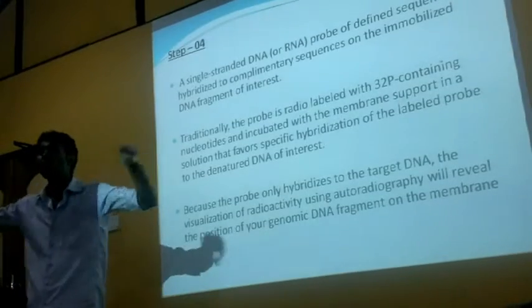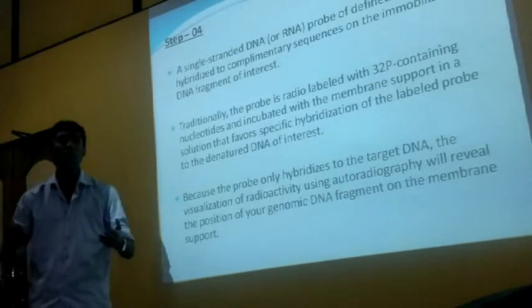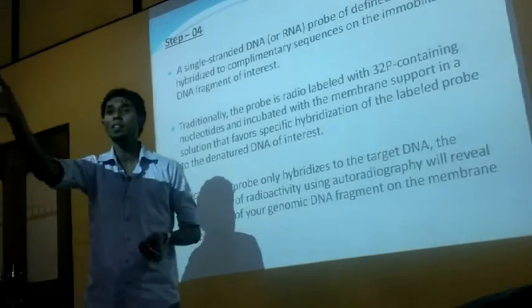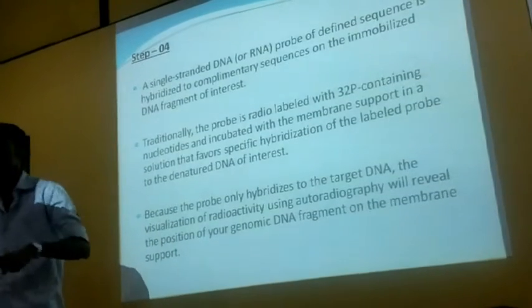We know the sequence of the nucleotide strand, I mean the probe that we are sending. For example, say you need to identify an insulin producing gene in the nitrocellulose layer. So you take an mRNA copy. You know how protein synthesis occurs, right?